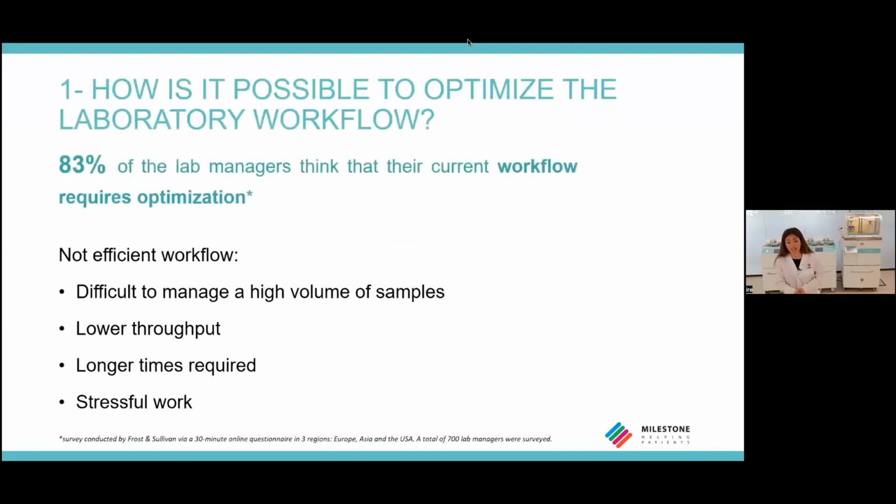According to a recent survey with lab managers, the laboratory workflow requires optimization. If the workflow is not well organized, it has a direct impact on how many samples a lab is able to process, how fast, and also with how much pressure for the worker, for the histotech.